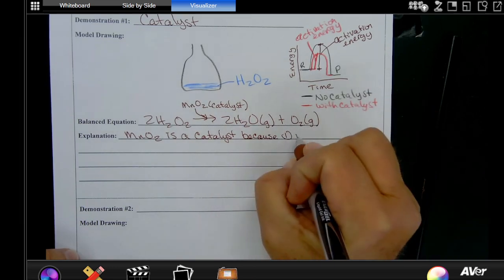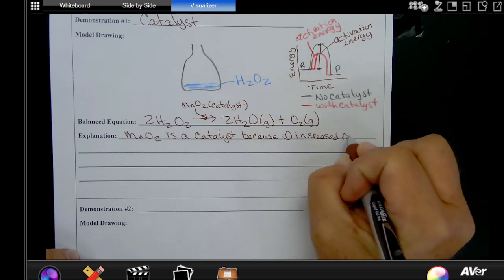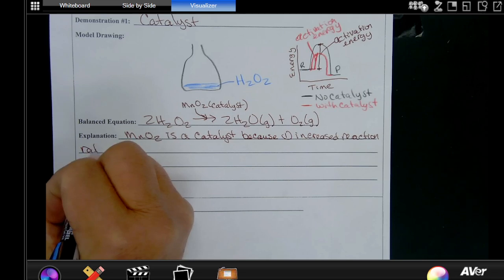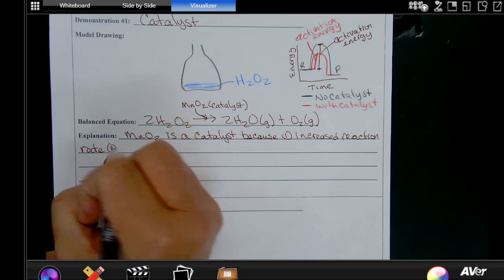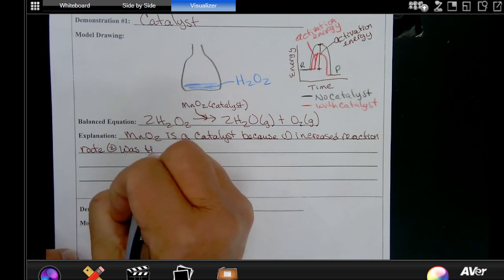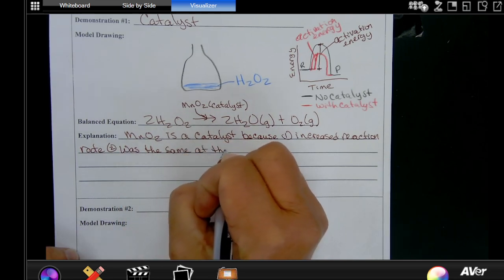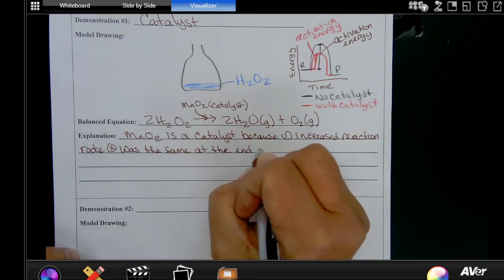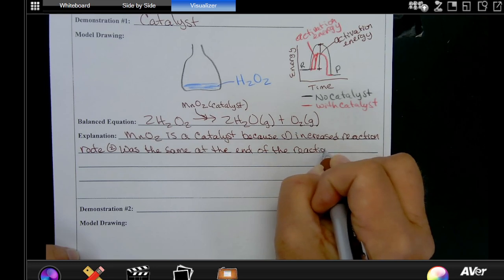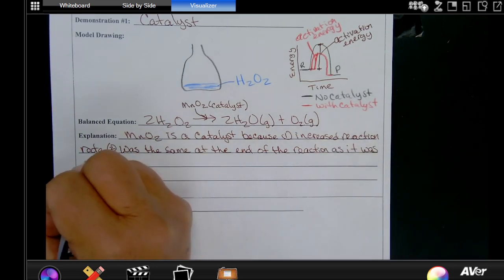One, increased reaction rate, and two, was the same at the end of the reaction as it was in the beginning.